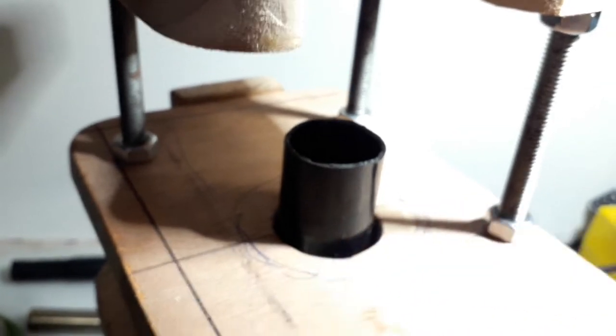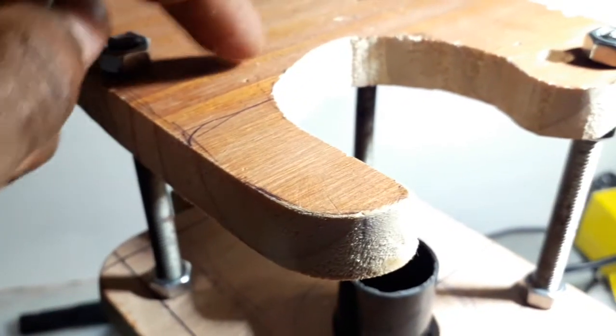Let's talk about eyepieces and the lens holders below. These are pieces I 3D printed. Of course, I got a tube. I have more tubes in the back. I collect them. These are metal tubes for ordinary types of scopes. I place the tube in there, I place the gear there, and the tube will be going up and down instead. But I'm starting to like this way of doing it because it's easier for me to rest the camera. As you can see, I can make camera mounts.